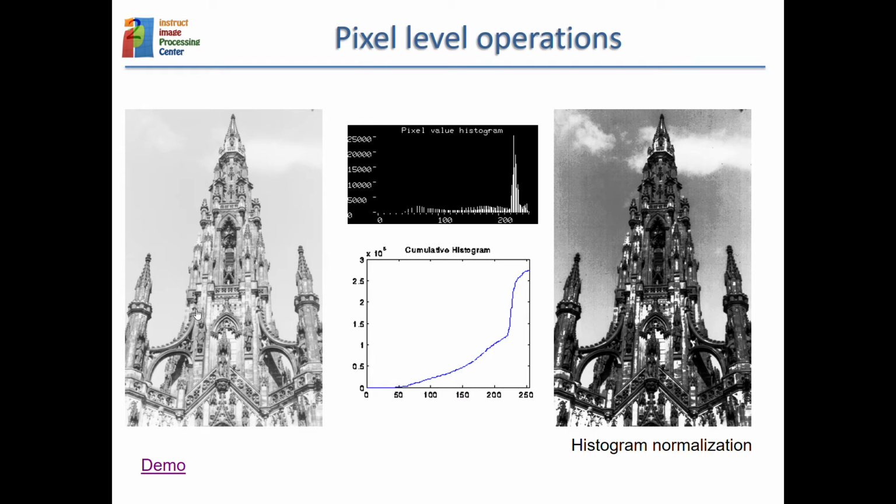But then I increase the contrast. So I increase the contrast in this area. Now all the values in this area around the threshold, where the slope is high, become more and more separated. This is what I was mentioning before. The distance that originally was 2 or even 1 in pixel values now becomes more separated, and they can be separated by 2, 3, 4 or more intensity values. But that comes for sure at a cost.